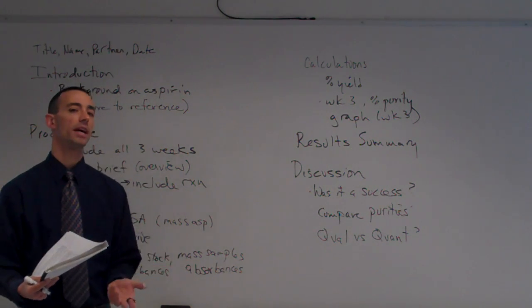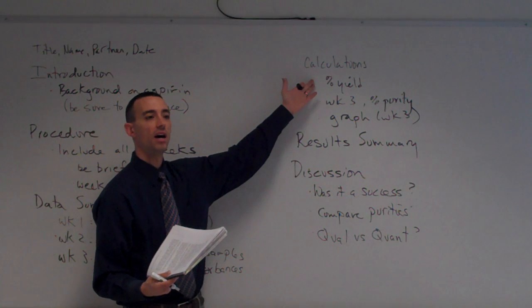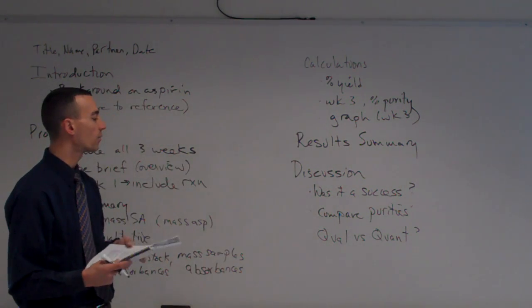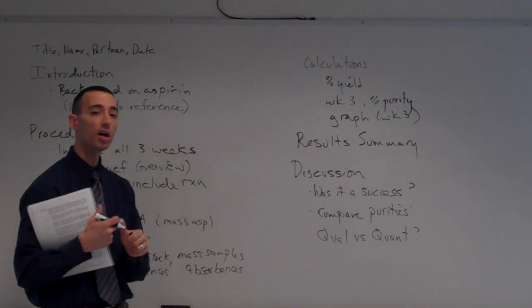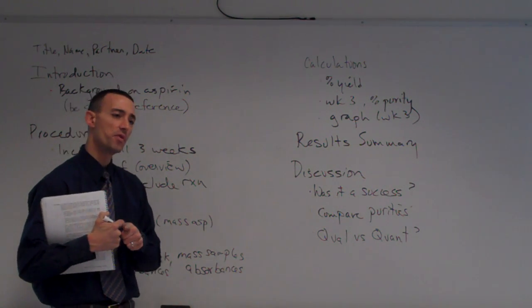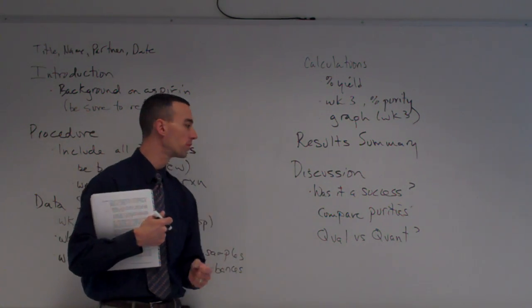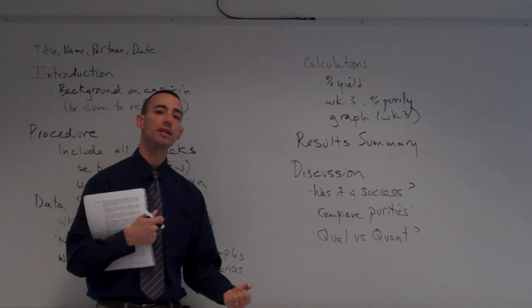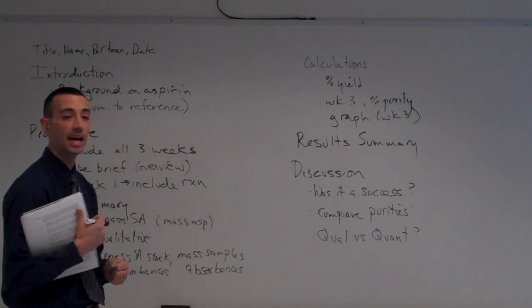What was your yield like? Did you get a very horrible percent yield in this process, and why or why not? What went wrong with the recrystallization? Perhaps you lost a lot of your sample. Or if you think back to visually seeing stuff drawn down through the filter paper, I know I saw in the lab a lot of solid floating in the bottom of those filter flasks.